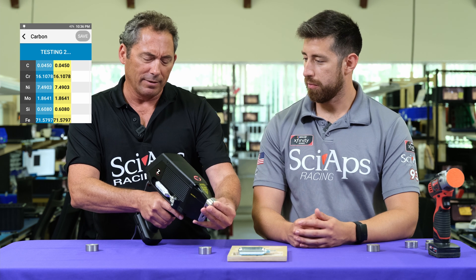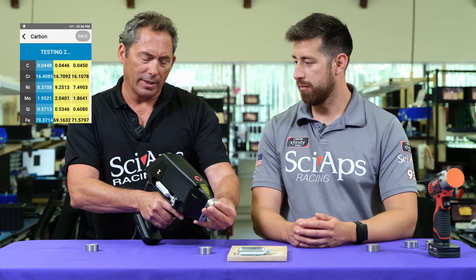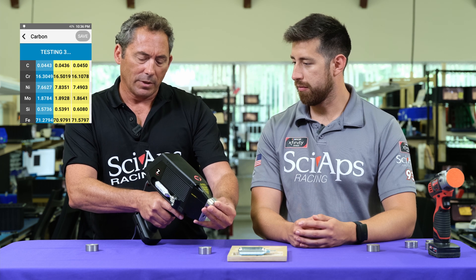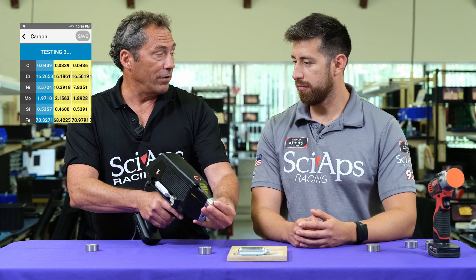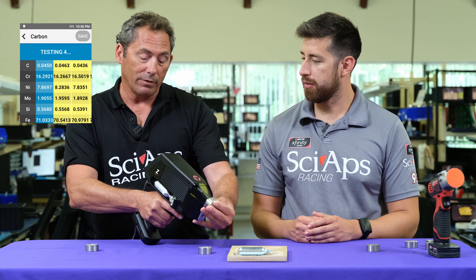This is an H grade — as you can tell, it's up around 0.45. So we'll run our several tests in a row again. 0.44, 0.45 — you expect even better repeatability at the higher carbon levels, which we're getting.